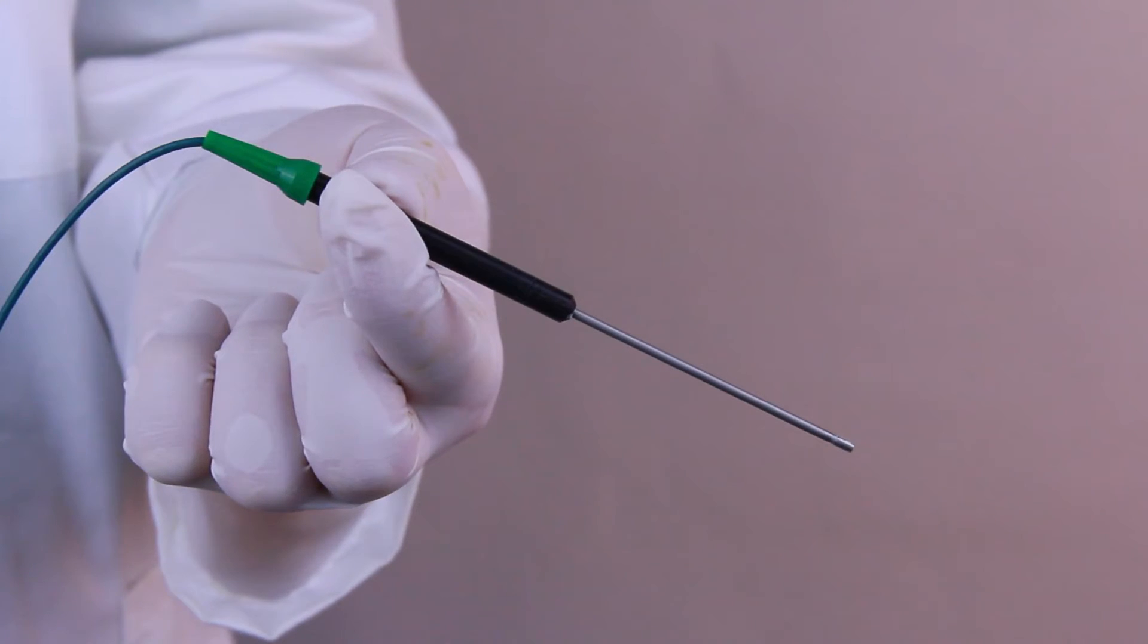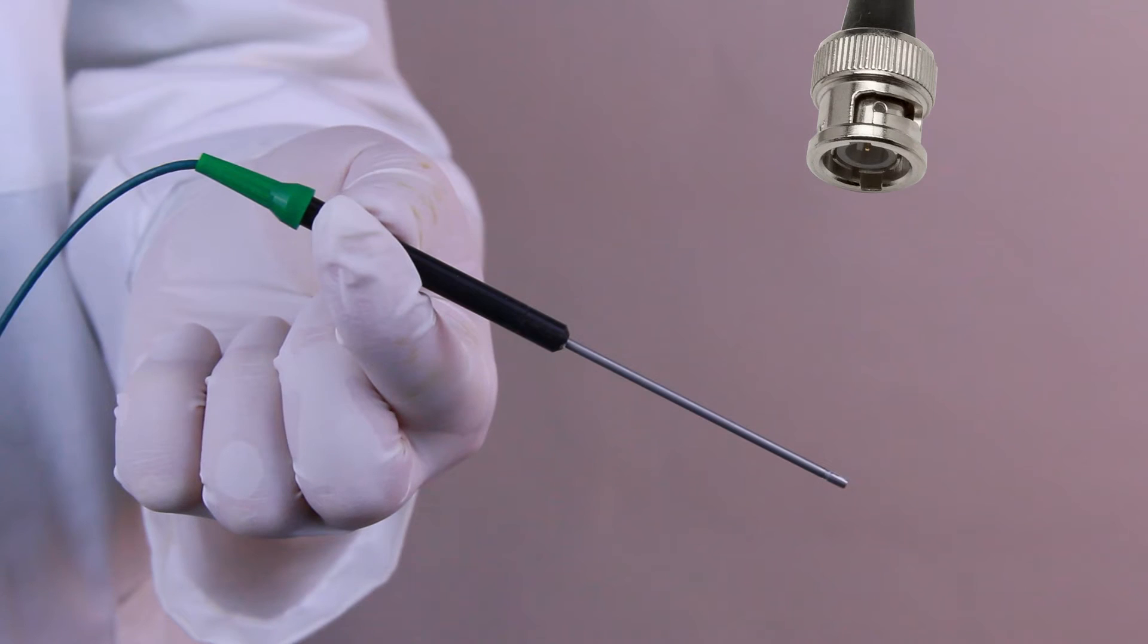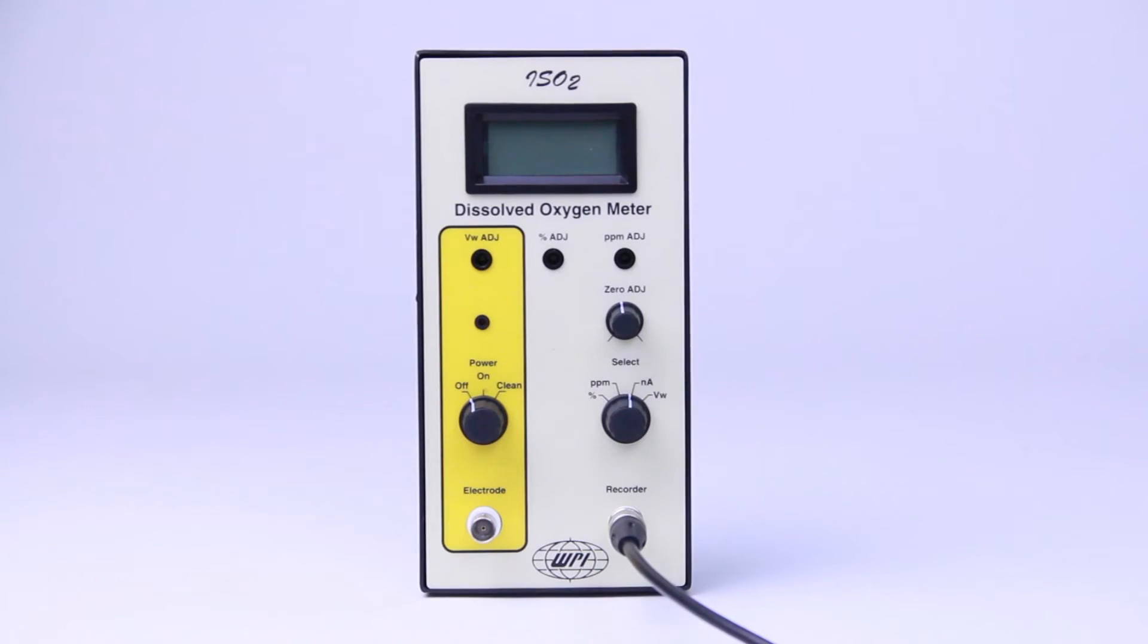The OxLP sensor is functionally identical to the iso-oxy-2, but has a different connector because it plugs into a different meter, WPI's iso-2 dissolved oxygen meter.